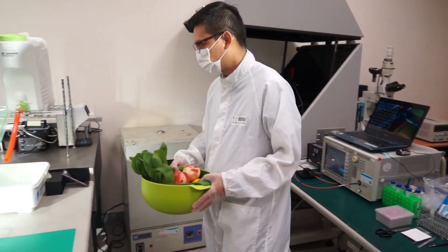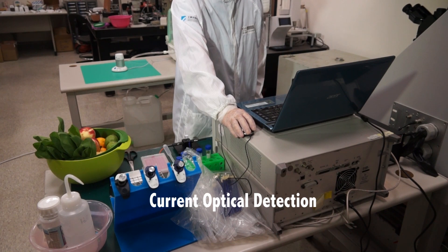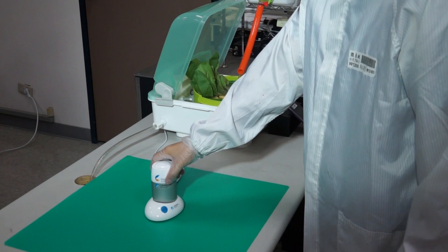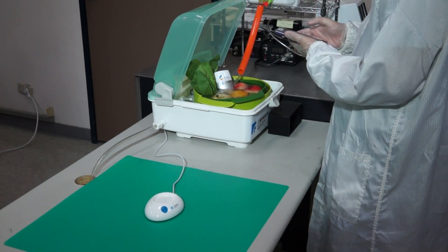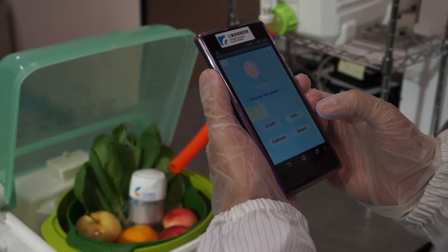E-Tree has developed the handheld pesticide residue detector whose optical detection saves users the hassle of any pre-test work. Users simply place the device into the water during the cleaning process, and they can learn whether the pesticide residues fall within the safe range.